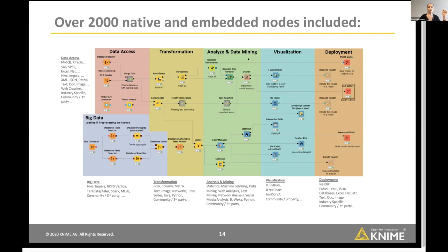There are also lots of nodes to actually perform analysis of the data. Different machine learning methods are implemented, and there are a lot of nodes to visualize the data so that you can get insights. We will go a bit more into detail on those while we are doing the exercise. And there are also nodes for deployment, to actually make the results of your data analysis available.